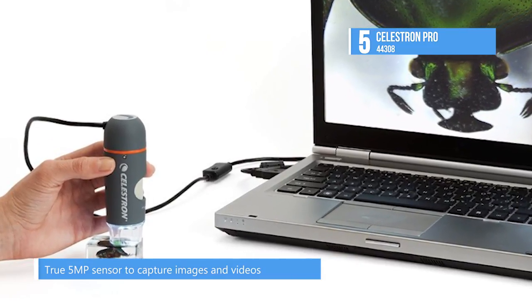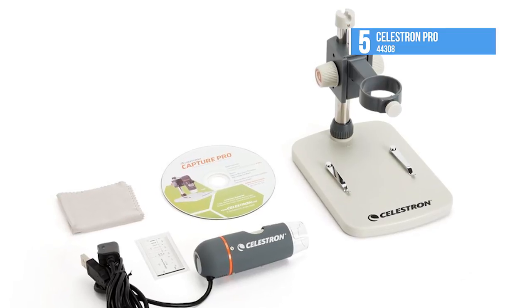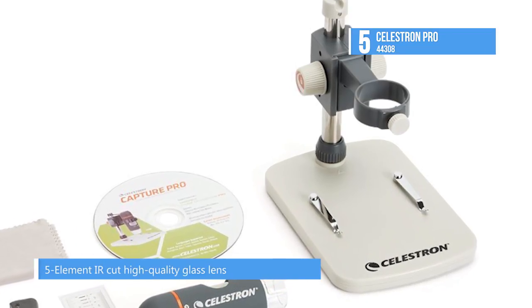Using the included wide stand with a metal rod, it allows you to adjust and secure your working distance and the horizontal position of the microscope above your samples. The base also provides two pre-loaded clips to hold your slides or flat samples.